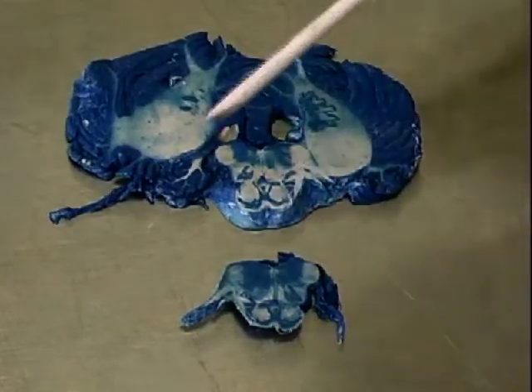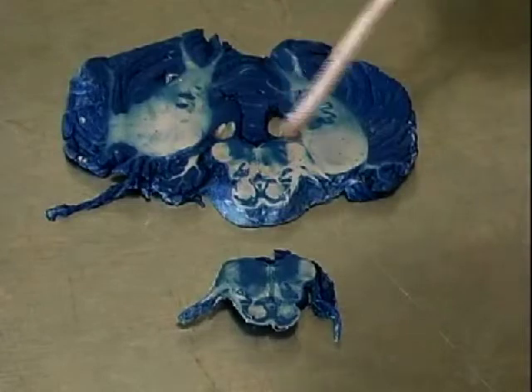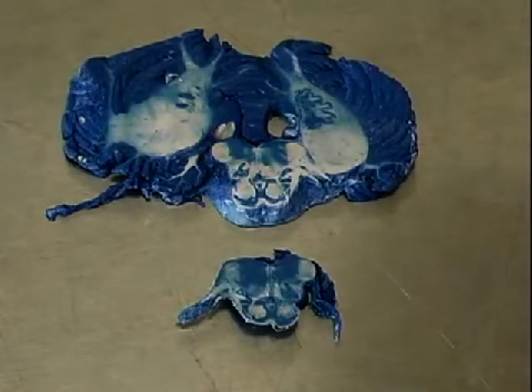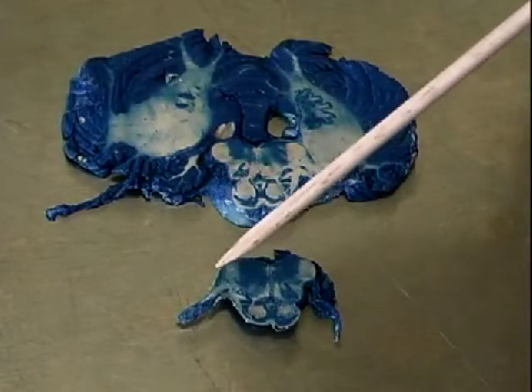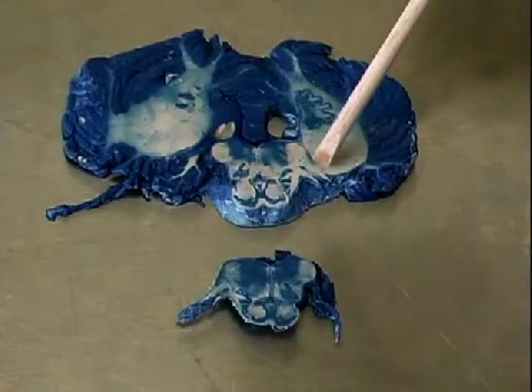Now here's a good two sections that will kind of show us things on our level 4. The defining characteristic of level 4 is this big myelinated bundle right here and here, called the inferior cerebellar peduncle, or the restiform body. Now don't forget, associated with the inferior cerebellar peduncle here would be cranial nerve 8. You can see it right here and you can see it right here.